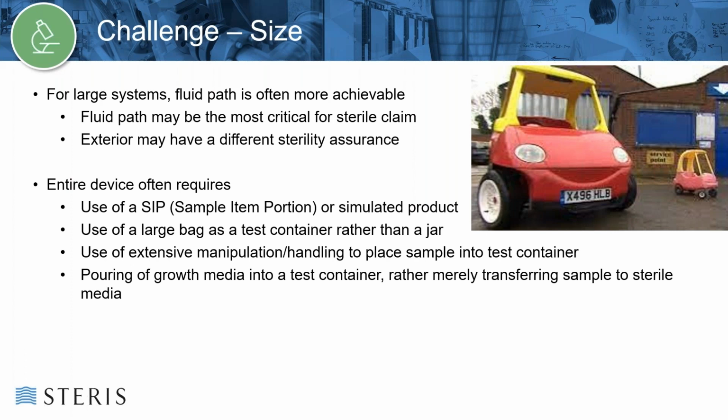We could also use large bags as test containers. These have some disadvantages in that they can be punctured by sharp objects within the test as well, whether there's needles or sharp pieces of plastic, they can puncture the bag. Similarly, bags can become quite heavy and difficult to move.